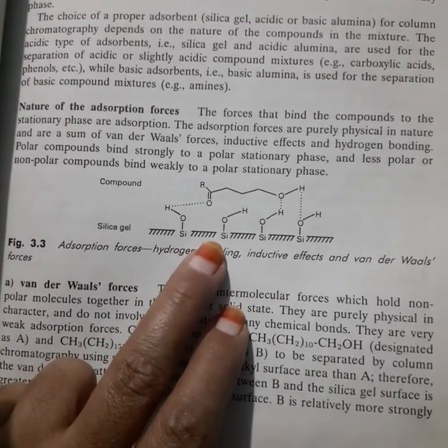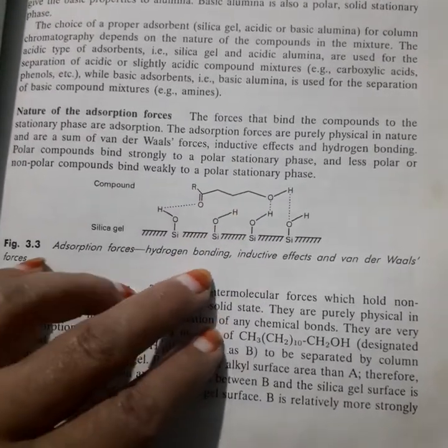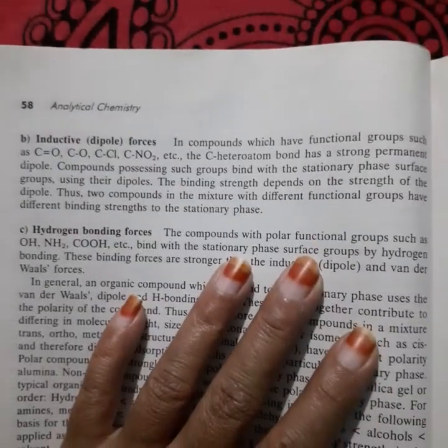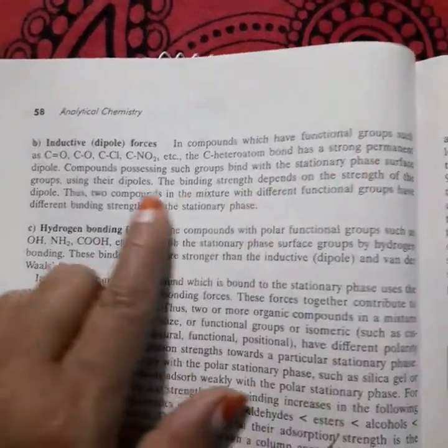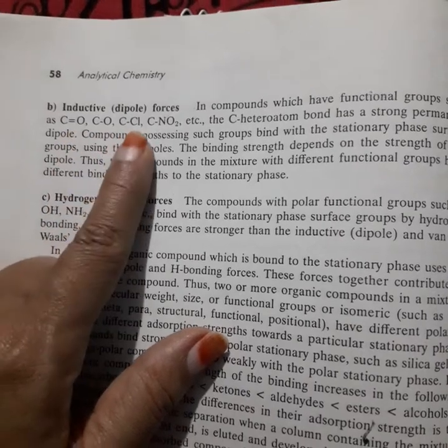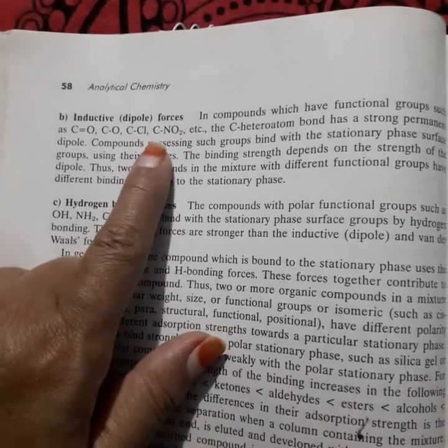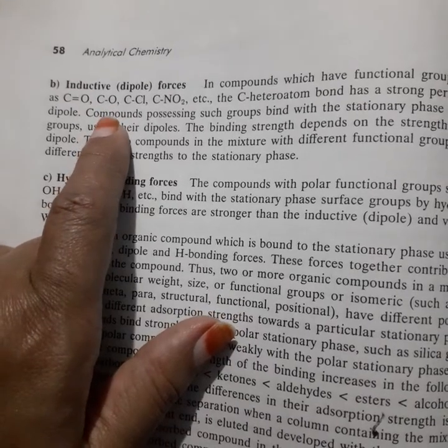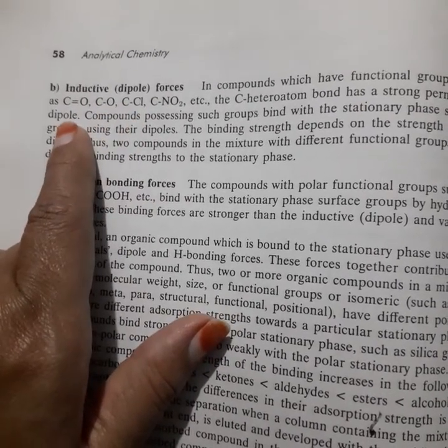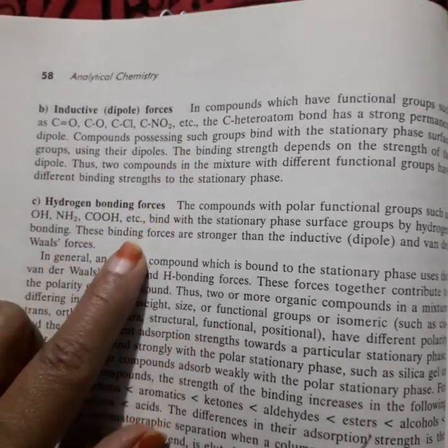Hydrogen bonding is the cause between this silica gel and this organic compound. And still one more is also there. What is that one? That is the inductive effect. Generally, if our reaction mixture contains functional groups like ketone or nitro groups, then in such conditions these heteroatoms like nitrogen, chlorine, oxygen obviously create a dipole. Because of that, it adsorbs onto the stationary phase.